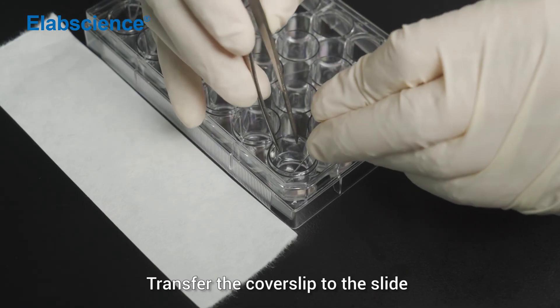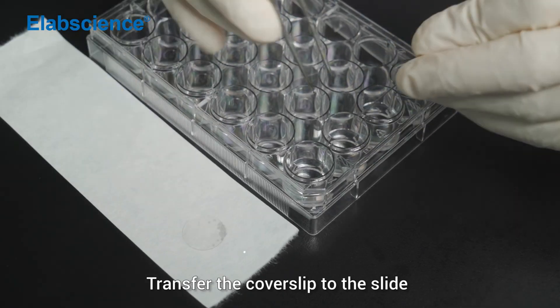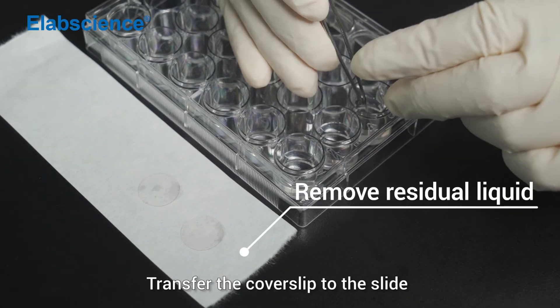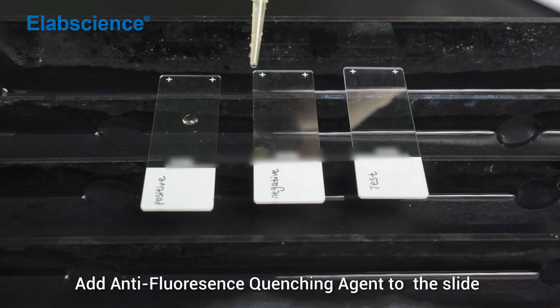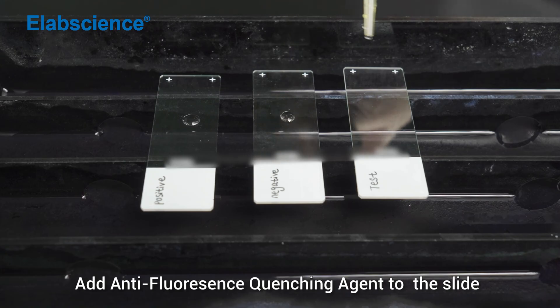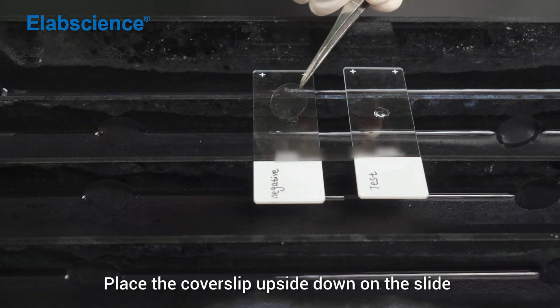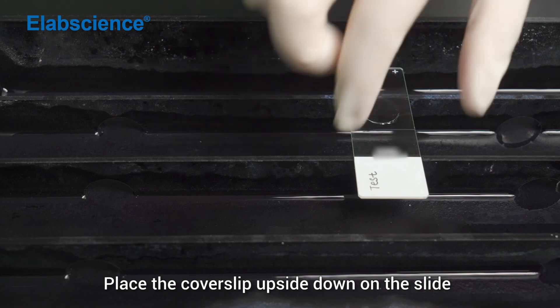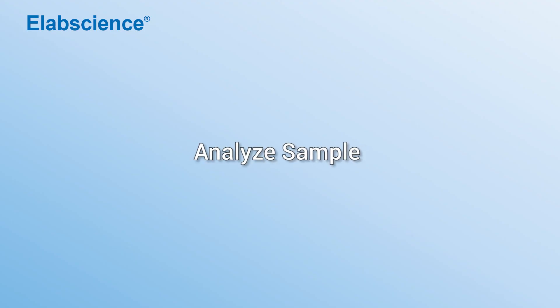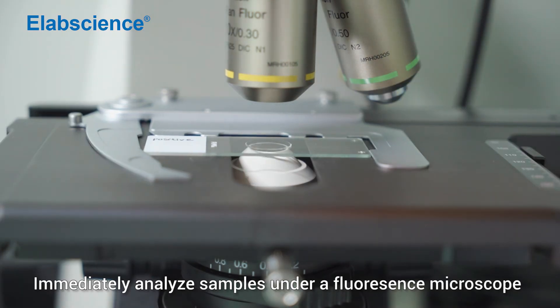Transfer the cover slip to the slide. Add anti-fluorescence quenching agent to the slide. Place the cover slip upside down on the slide. Immediately analyze samples under a fluorescence microscope.